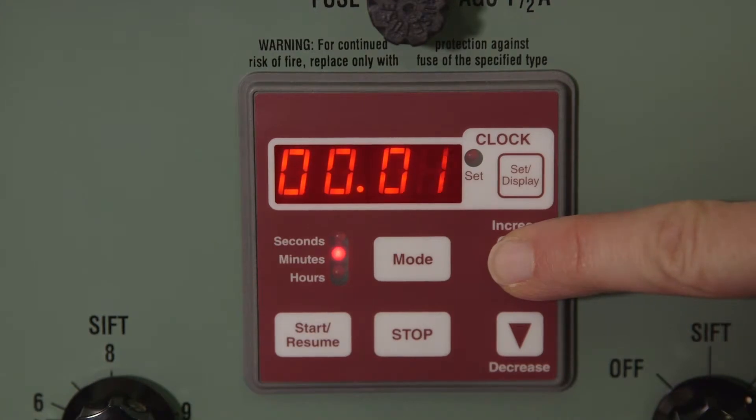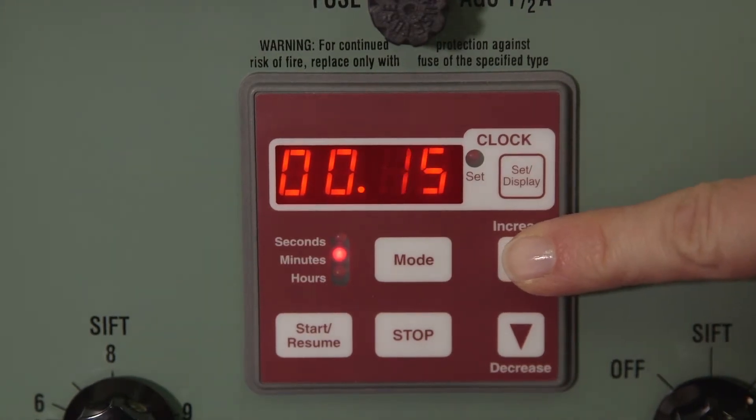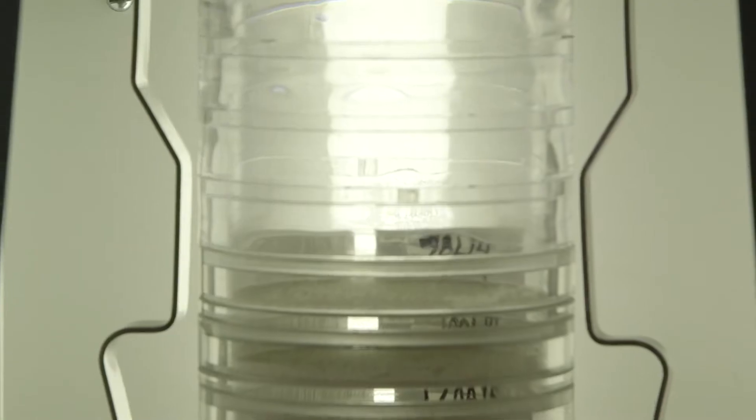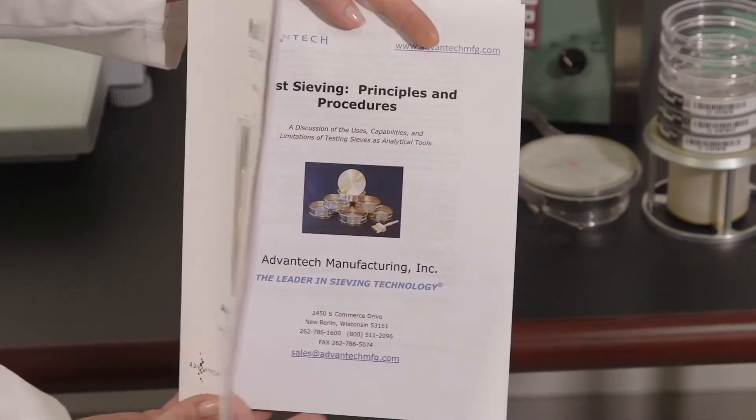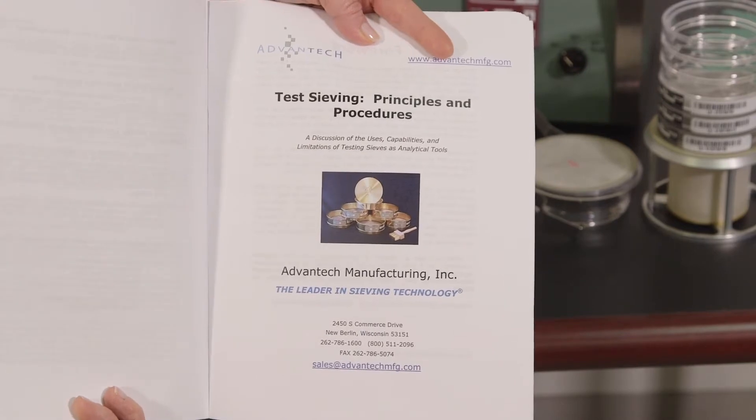The L3P timer has three modes of operation: seconds, minutes, and hours. Press and hold the mode button for one second. The LED will illuminate which mode is engaged. Set your countdown value by using the increase-decrease buttons.